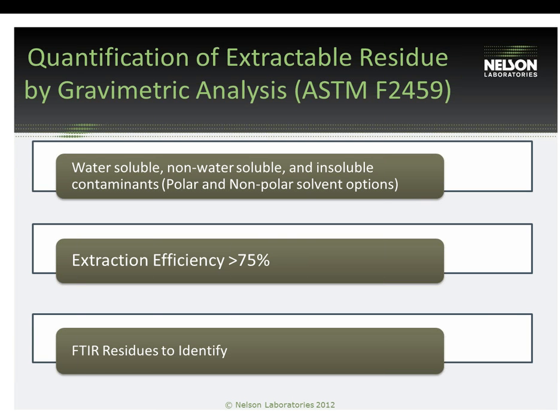And so this gravimetric test in combination with FTIR is a great pairing to quantify the residues. And then if you're getting a substantial amount of residues, we have this tool to help you maybe go back to the process and try to reduce the risk of that contaminant that's being left behind.